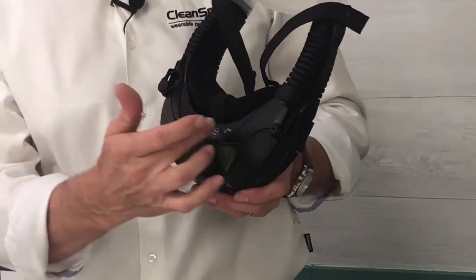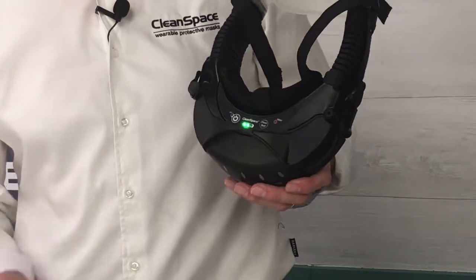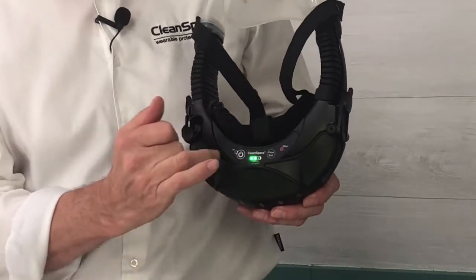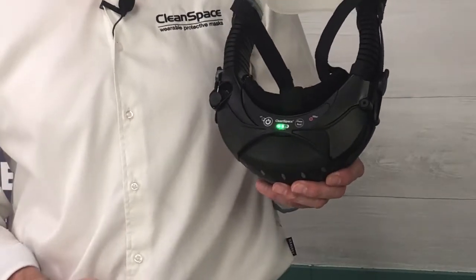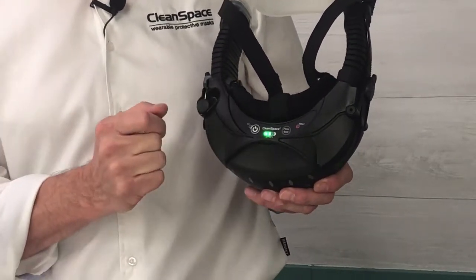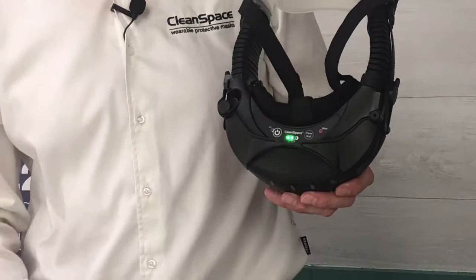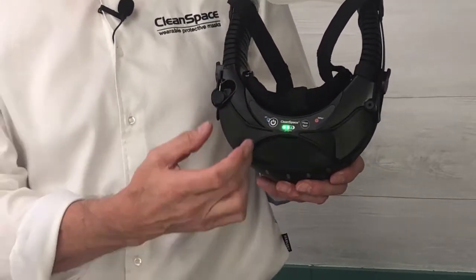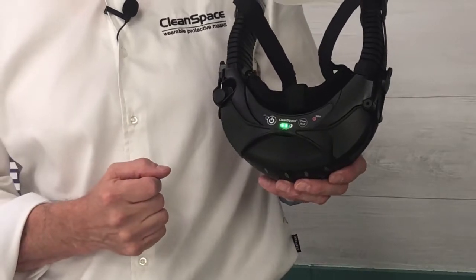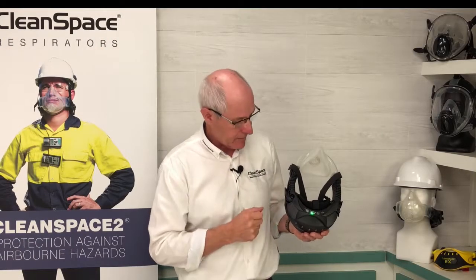So let's look at the control panel on CleanSpace. You'll notice that we have two buttons. We have some battery indicator lights, and we have a little filter indicator light over here. To activate CleanSpace, we press and release the on button. That will illuminate the lights, the battery indicator lights. You may notice that you can hear that the CleanSpace is not running.